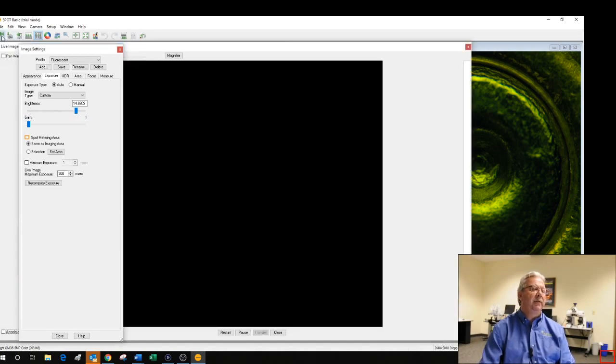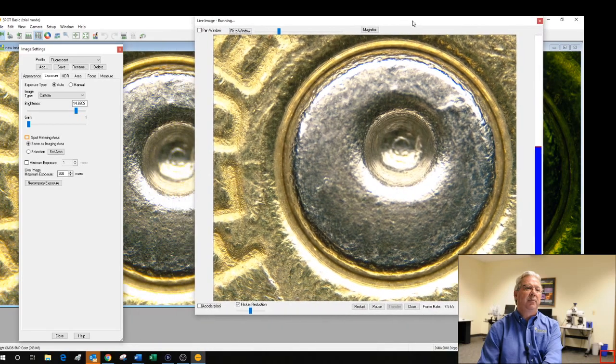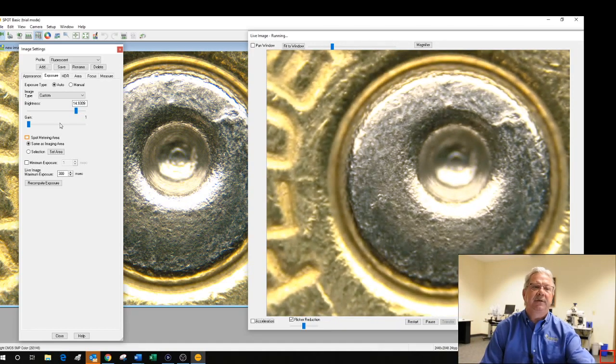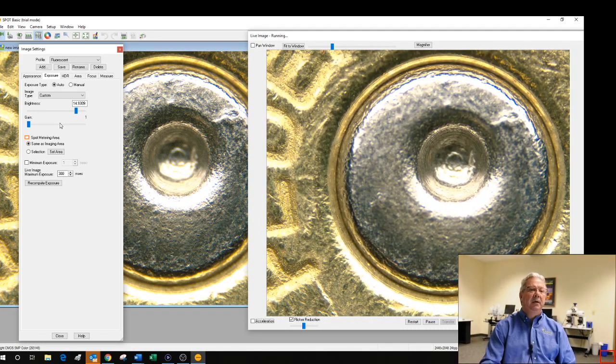And gotta bring my live image back up, forgive me. I'm going to resize this box, and because I have permissions, the next time I open fluorescent, it's going to appear like this. Number one, the new camera is much faster. I don't think you'll need gain as much as maybe you did in the past. I'm going to focus the microscope here, and as long as the microscope's moving with me in real time, I don't feel like I need gain.